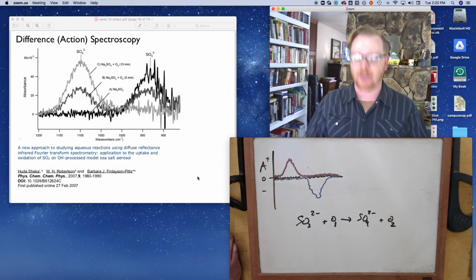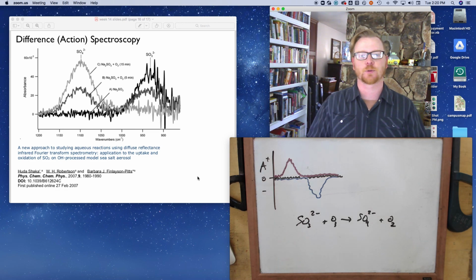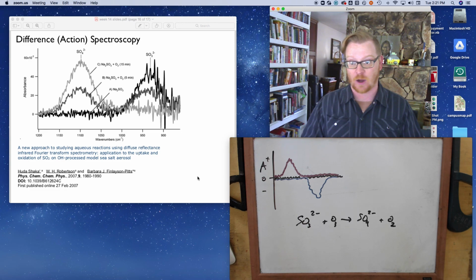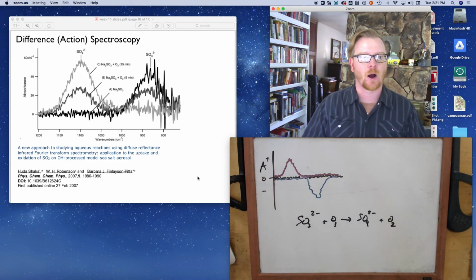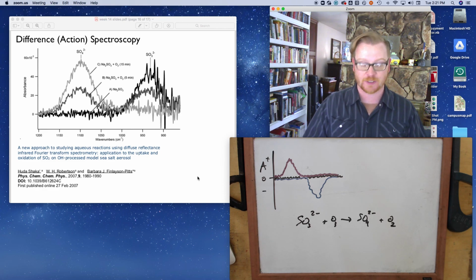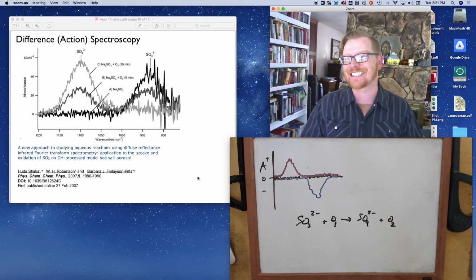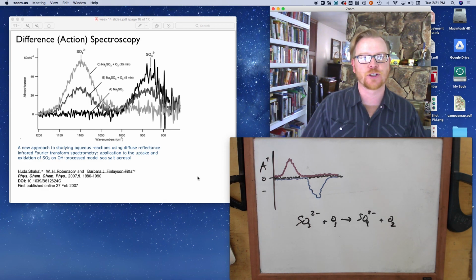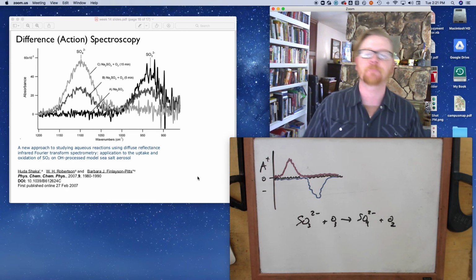Okay, folks, so that'll be the last lecture for this week. So your quiz is mostly just going to be asking you conceptual information, highlighting the differences between the techniques I've talked about. So the main techniques I've compared are dispersion spectroscopy and Fourier transform spectroscopy, as well as some of these different accessories. You should know the difference between a single beam spectrum and an absorbance spectrum.